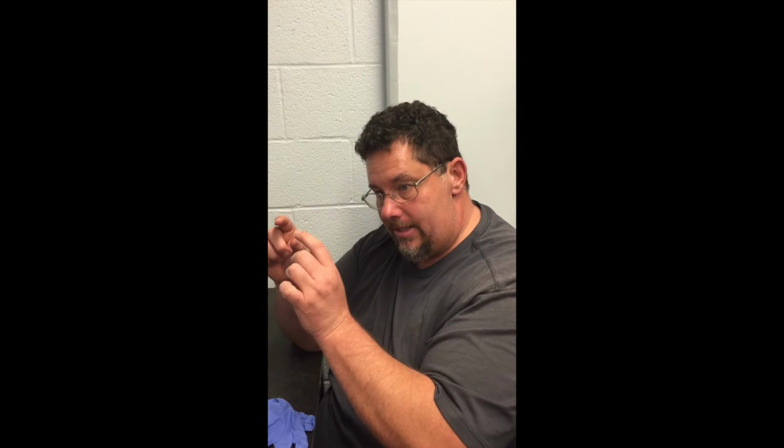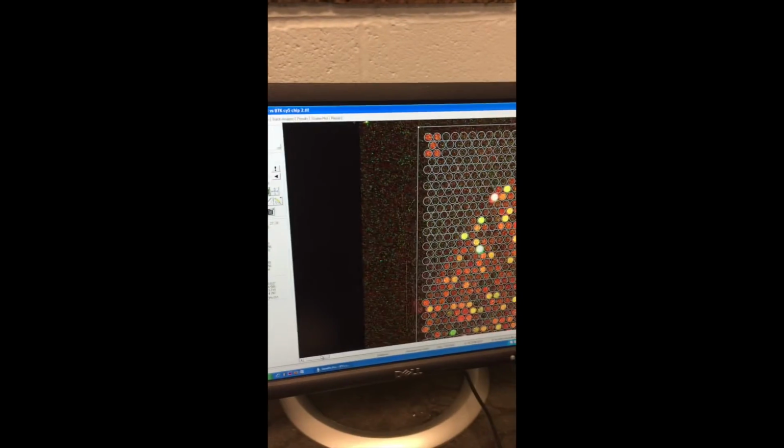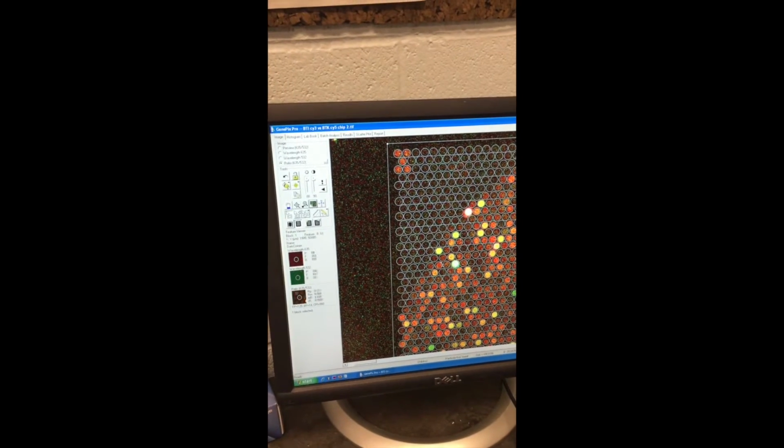These are fluorescent units, these intensities, also known as FU units. And so the computer will pick up that, and those signal intensities would then be statistically analyzed in another software program. So let's go ahead and hit this. There's a hotkey, is what they call it, where I'm going to tell the computer to find these features.